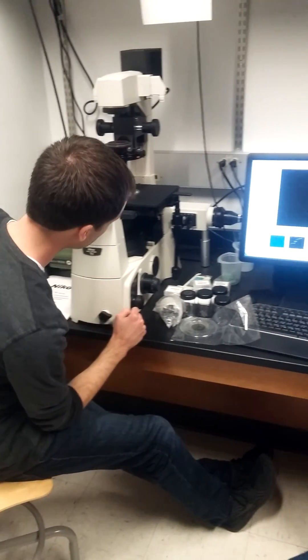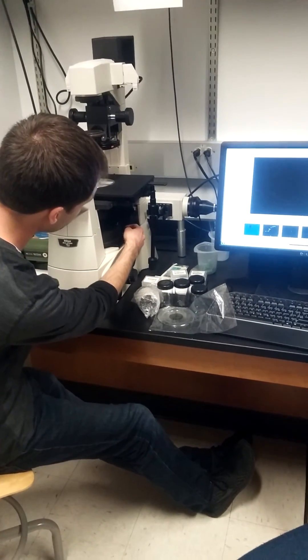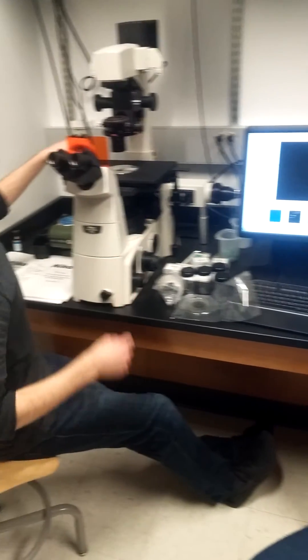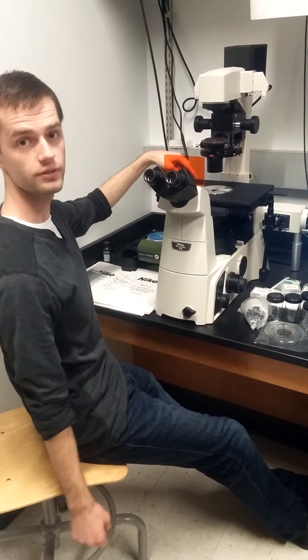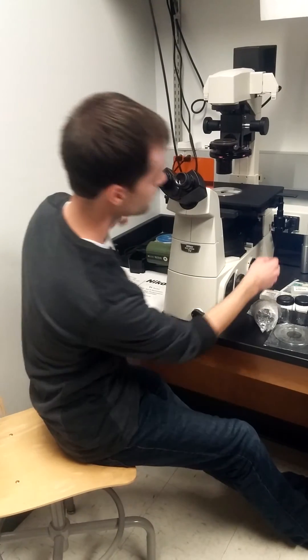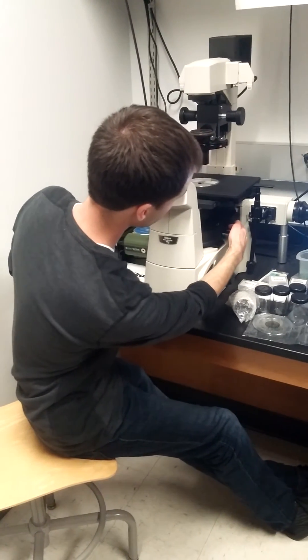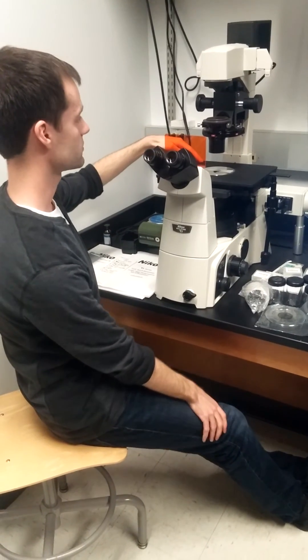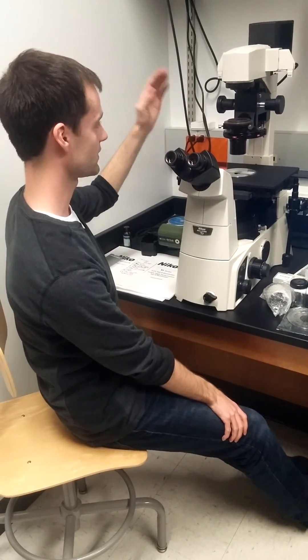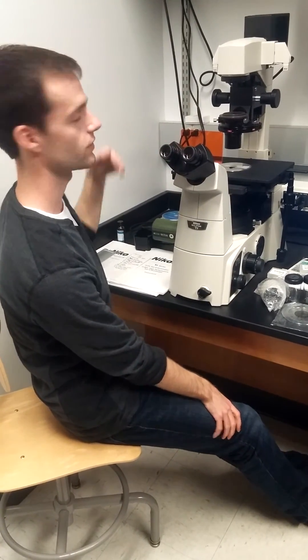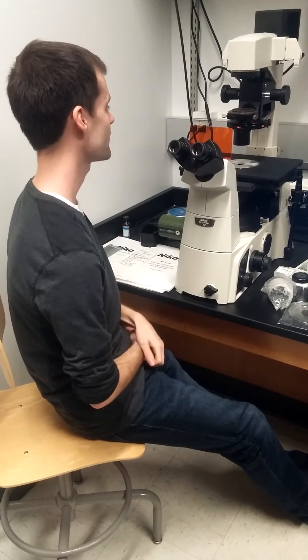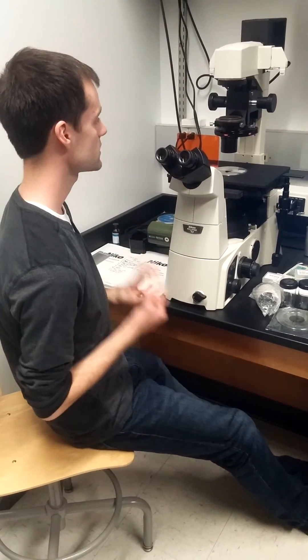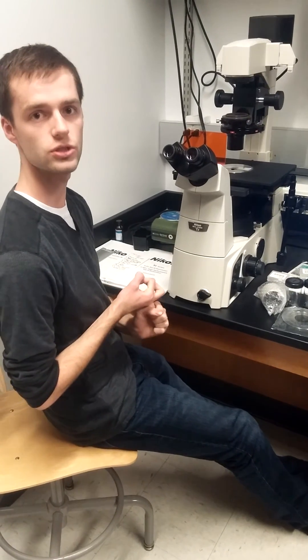Finally, just to clarify, it's important that when we have a specimen on our stage and we're not actively viewing it, that we close this shutter because otherwise our specimen will be flooded with the fluorescent light and we'll get photobleaching effects, which can damage the cells and damage the dye so we don't get good pictures.